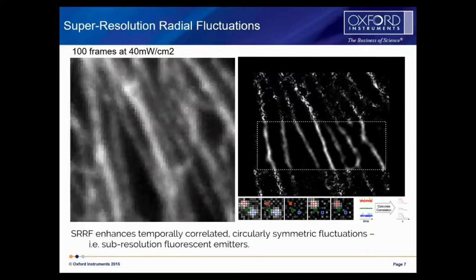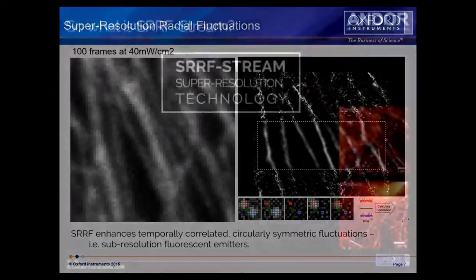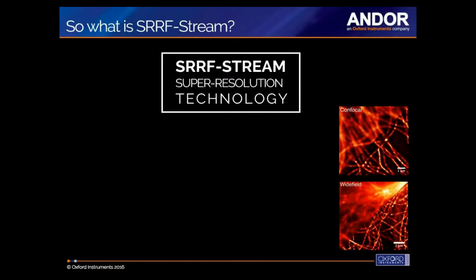And then we can rebuild the image from that, and then we have this super resolved image. Okay, so we've just mentioned what SRRF is. So what then is the difference between normal SRRF and SRRF stream?